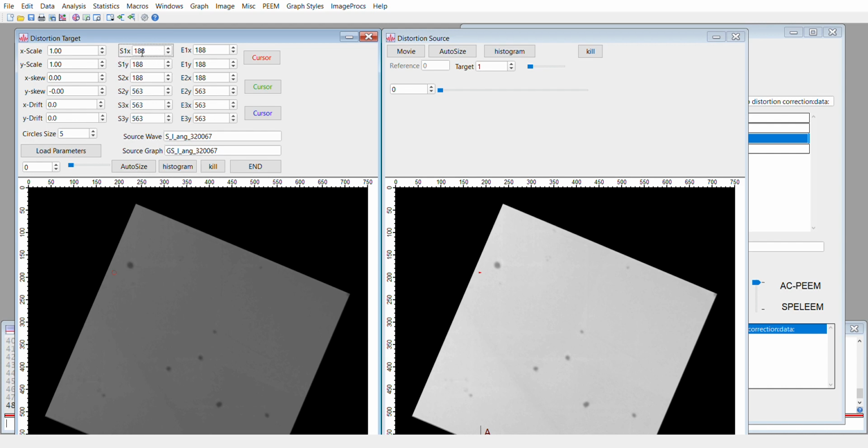We will have to identify 3 defects on the surface that are not aligned, and overlap them from the target to the template image.